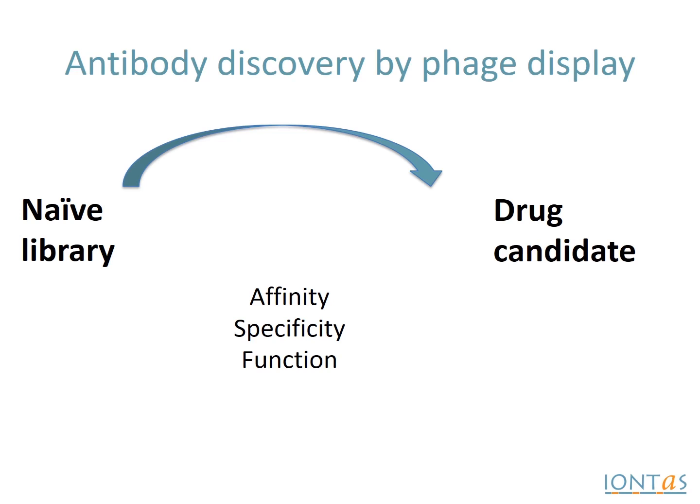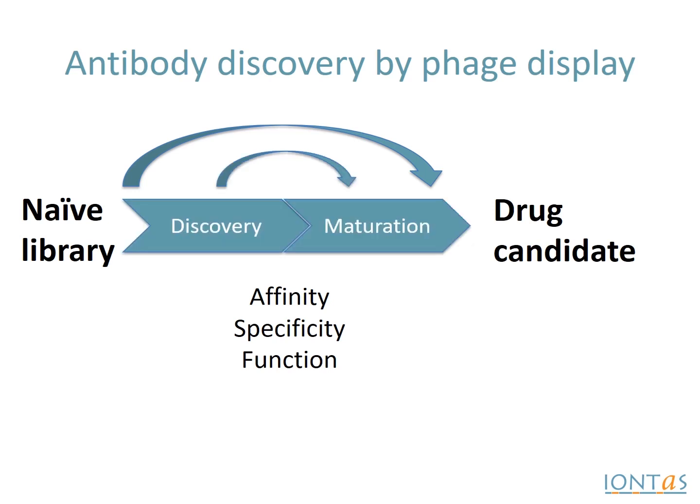We found with this in vitro system that we indeed had power to push affinity, push stringency to generate the highest affinity antibodies from a population. Also in some way, because it's an in vitro system, we were able to direct specificity and ultimately generate a large panel of human antibody molecules that we could then screen for specific function. And being this in vitro system, we could create large libraries, even derivative libraries, from an initial starting molecule and go on and generate better and better molecules.